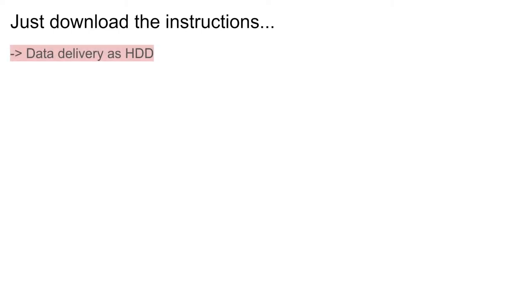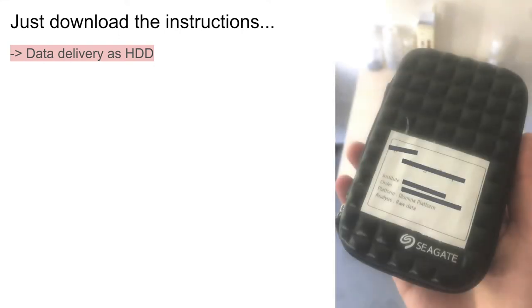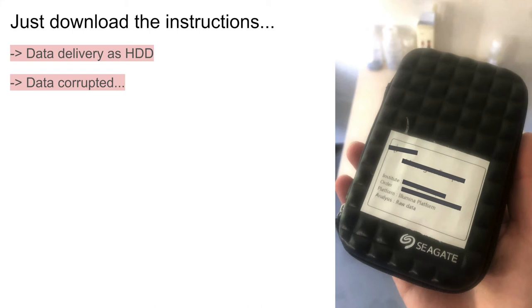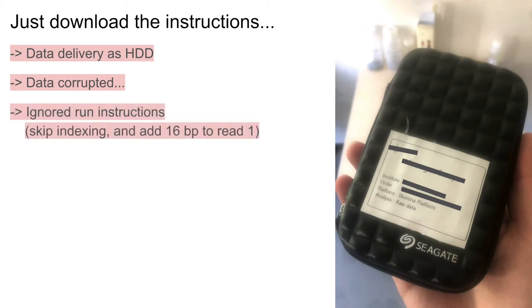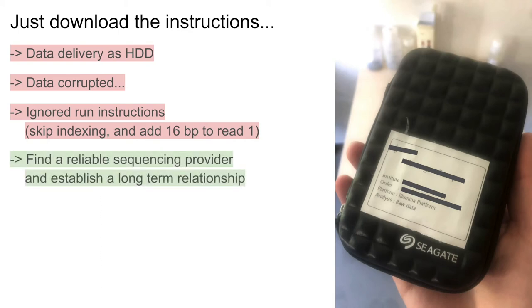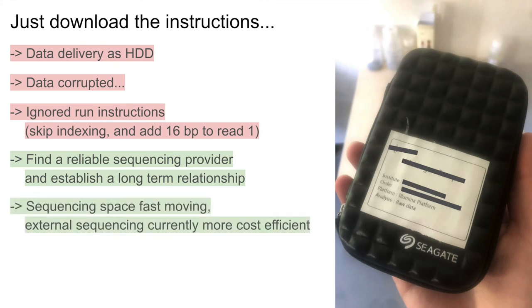There were unfortunately a few hiccups in getting hold of the data as well. The sequencing provider did send the data on a hard drive, which is not super efficient. Also, the data was corrupted — a few files did not contain the correctly formatted data we requested. And the provider also ignored our instructions on how to run the Illumina machine specifically. I recommend having a sequencing provider where you can build a long-term relationship, so they know what kind of data you expect and how to deliver it efficiently. Even with these issues, it's still more cost-efficient to send samples to an external provider in most cases, especially because the sequencing space moves so fast — you don't want to buy a machine that's outdated after a few years.